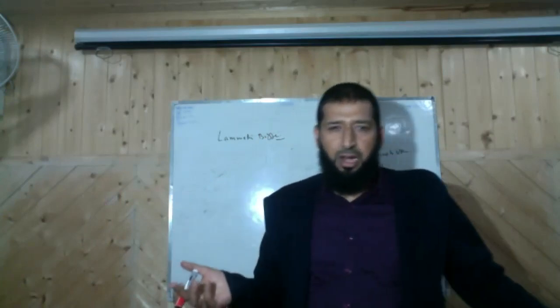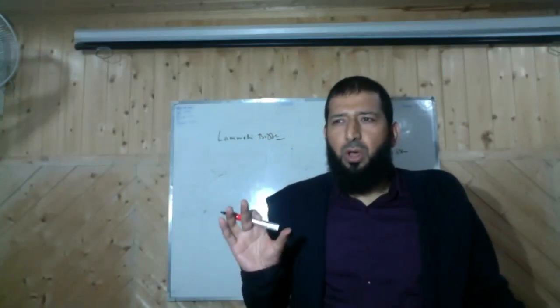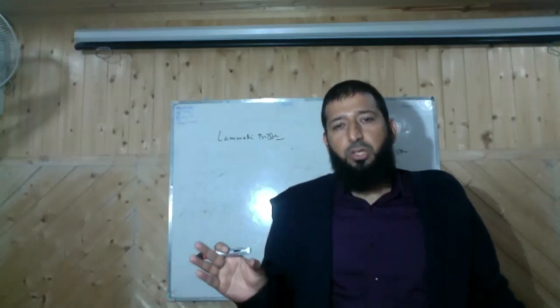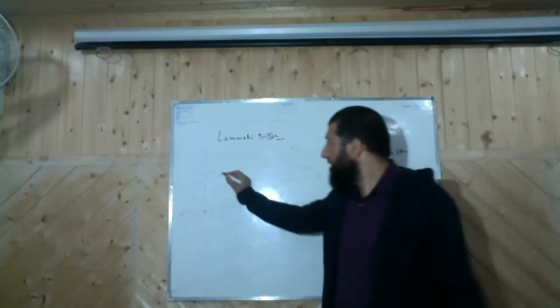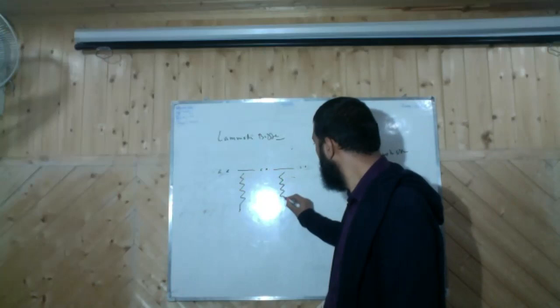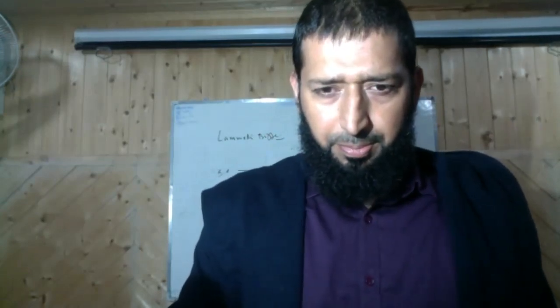In case of proteins, some are amphoteric, some are negatively charged, some are positively charged, some do not have a charge. So in their native forms, proteins will not be able to run in a gel because they do not have a uniform charge. So what we do, we add SDS. SDS binds with the peptide bond and gives a uniform negative charge to your proteins.